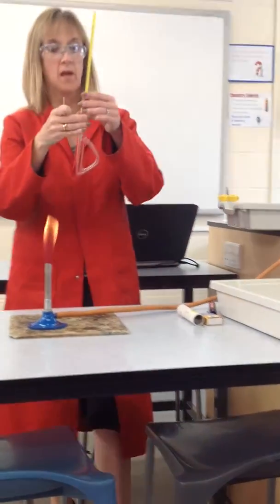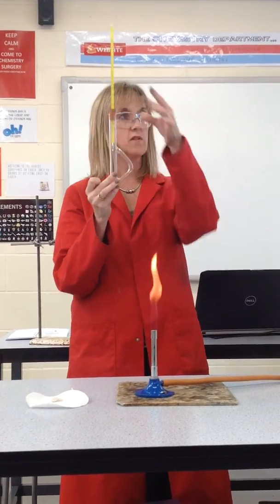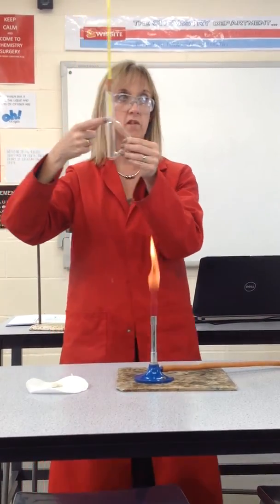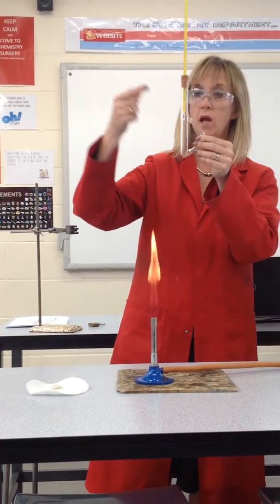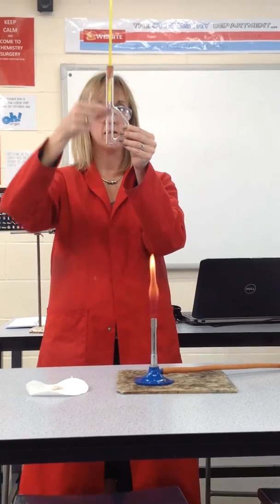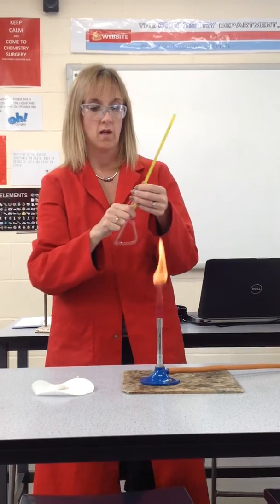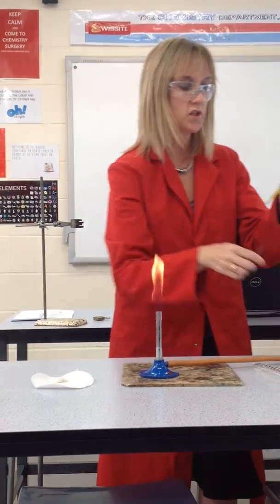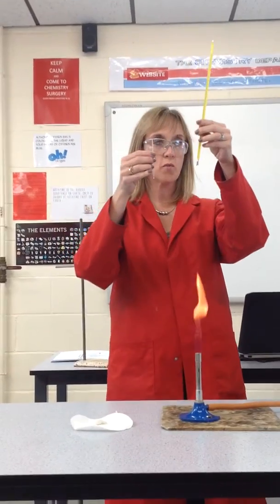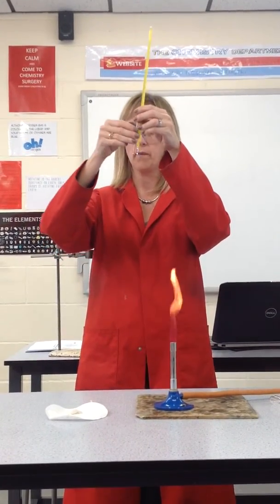Then you get your Thiel tube. Miss Osborne's done a fantastic job matching up the thermometers in the Thiel tubes. We are using mercury thermometers today, so we're going to be very, very careful. The mercury bulb is in line with where the tube meets the straight part — the sort of junction — and that's where they need to be. What you're going to do is attach your capillary tube to the thermometer so the crystals are next to the mercury bulb.